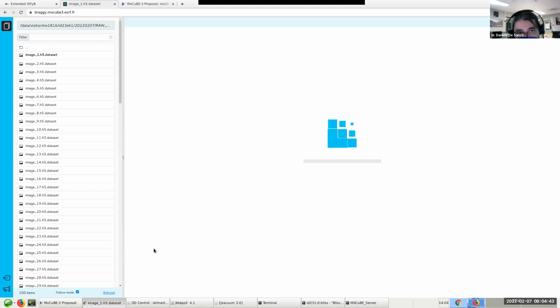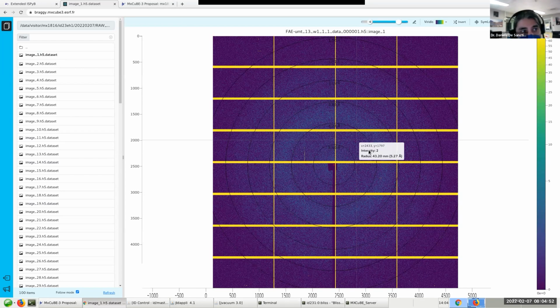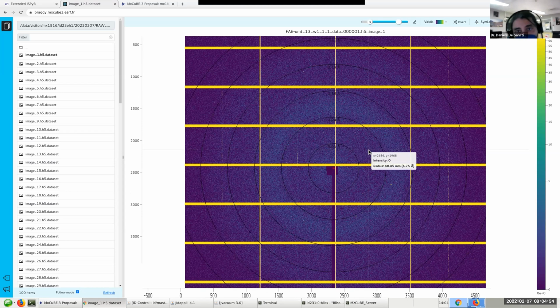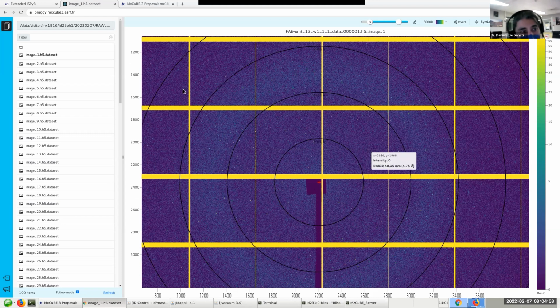Probably the follow mode is not going to perform great on these large images. We still have seen a bit of improvement. But you see that these are the images being collected, which is not bad at all. You can just surf through them.